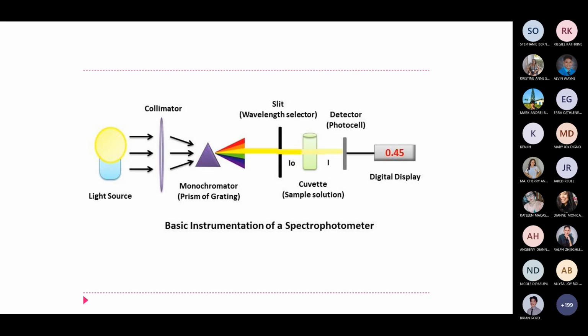So yung collimator, its main function is to stop all the non-perpendicular photons from striking the light or the crystal. Okay, ang main purpose niya din is to change the diverging light or other radiation from the point source into a parallel beam. Okay, so yung entrance slit naman, as a review, anong ginagawa ni entrance slit? It minimizes. Ano minimize niya? Stray light.